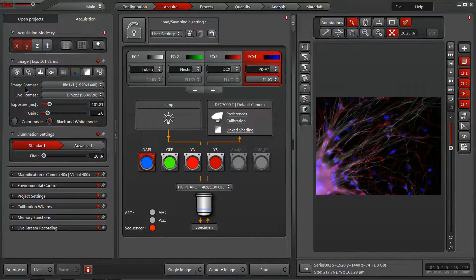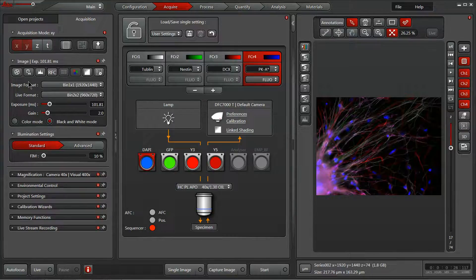Beneath that, we have our imaging control window, where our cameras, exposure time, gain, and settings can all be accessed. These can be either identical across multiple channels, or customized for each of the channels that you've set up.